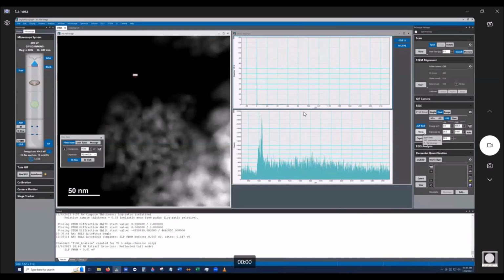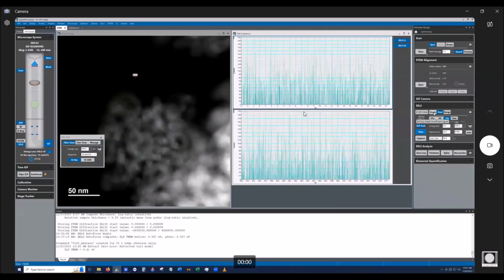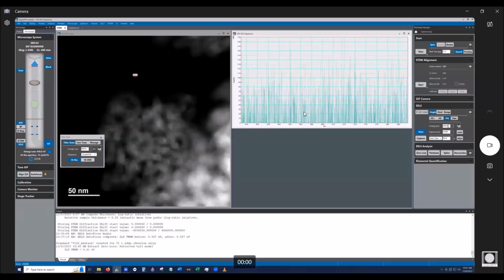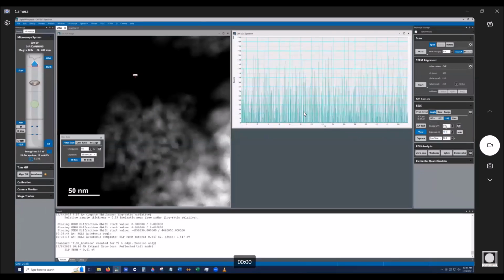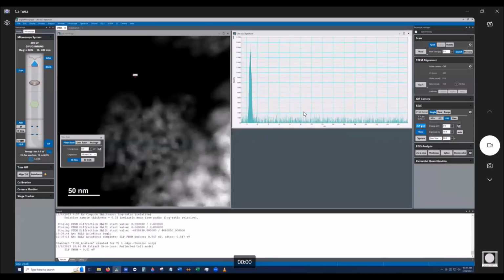All right, so let's click. We can leave it right there. Just click view. Let's switch this actually into single. All right, so we have to find, oh, we're blanked. There we go. All right, so we have to do autofocus here.